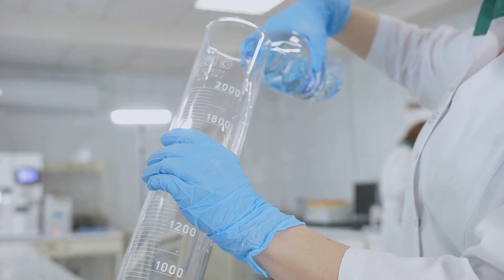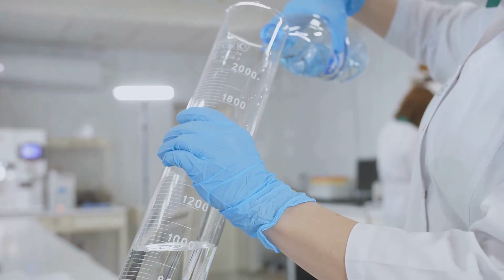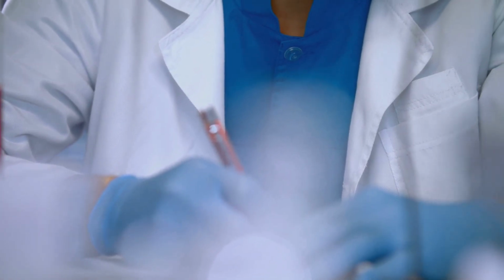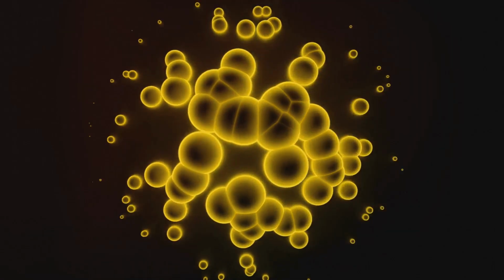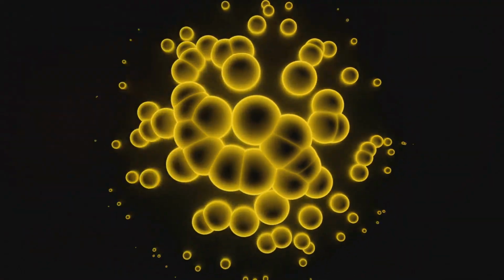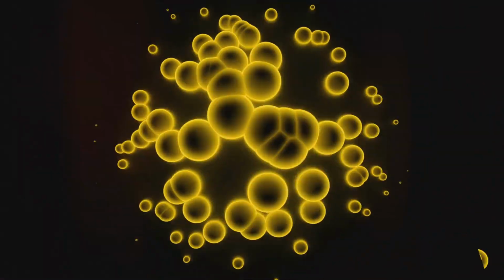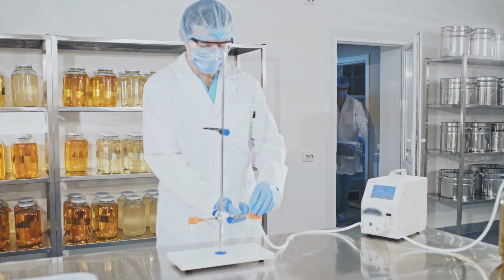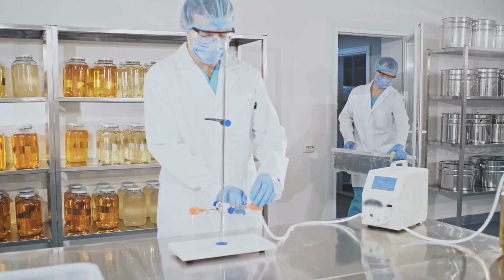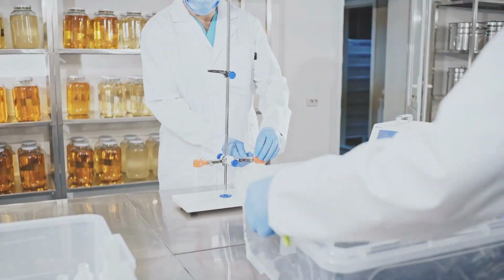Next, let's talk about how much detergent you actually need for your experiment. This is a crucial step that can make or break your results. Enter the critical micelle concentration, or CMC. This is the minimum concentration where detergent molecules start to form micelles in solution. Above the CMC, detergents self-assemble into micelles, tiny structures that are essential for solubilizing membrane proteins and keeping them stable in solution. To ensure complete solubilization, use 2 to 5 times the CMC, or a 10-to-1 detergent to protein mass ratio, whichever value is higher. This gives you a safety margin.